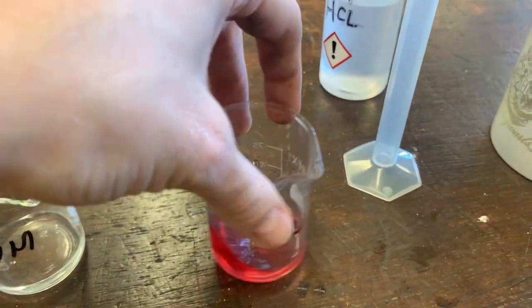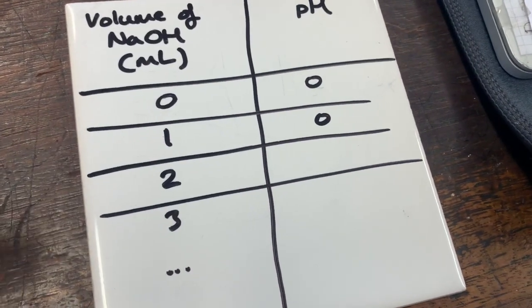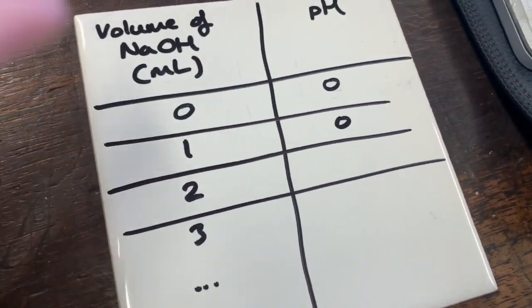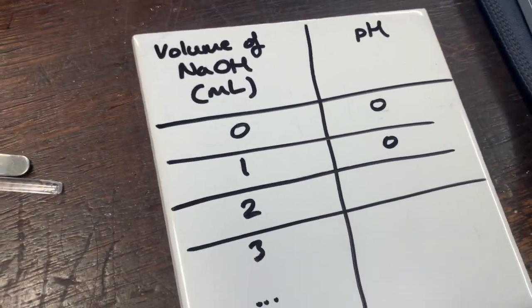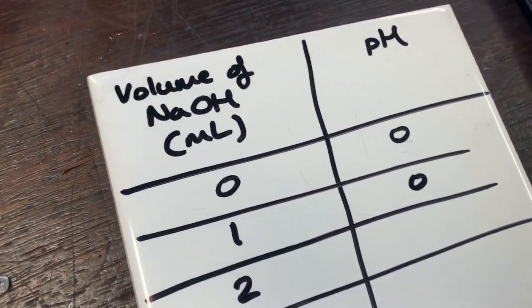There doesn't seem to be any change. In your book, as we go through this experiment, you want to draw a table — I've done the first results for you. You can see the pH is still zero even after one milliliter. I won't be showing you the results anymore, so you'll need to record them in your book correctly to get the right results.